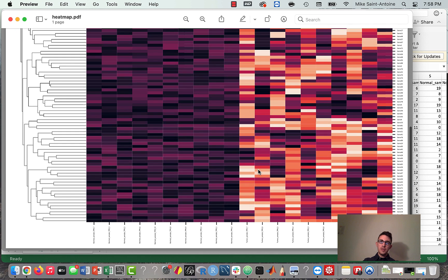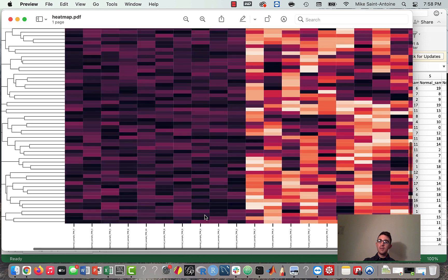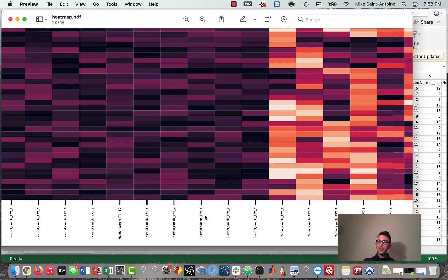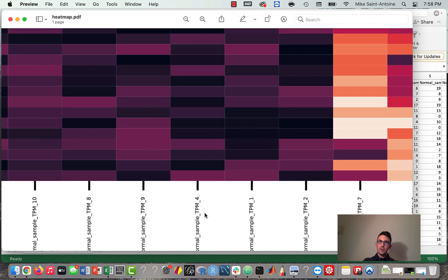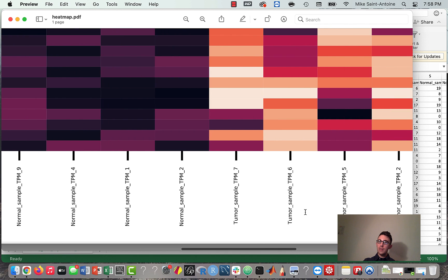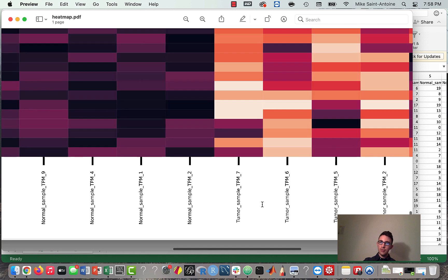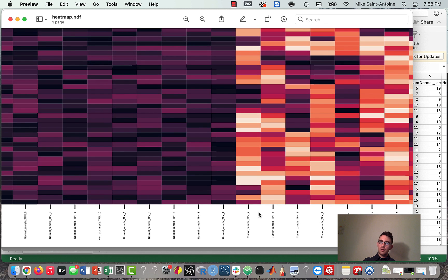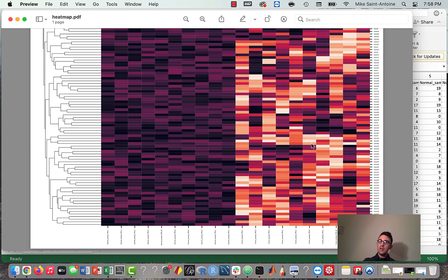I've made this fake dataset where I called some of them normal samples and some of them tumor samples. I made it on purpose so that the tumor samples kind of cluster together in terms of expression similarity, and so do the normal samples. So we can pretend like these came from cancer cells over here, and then these are from just regular cells.